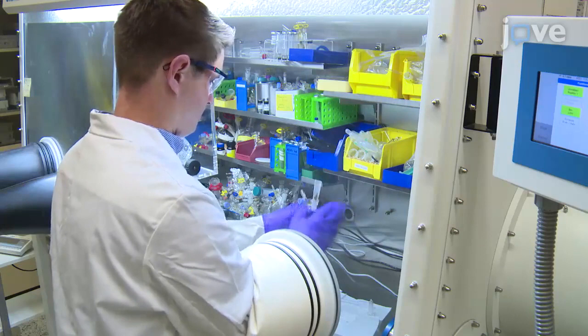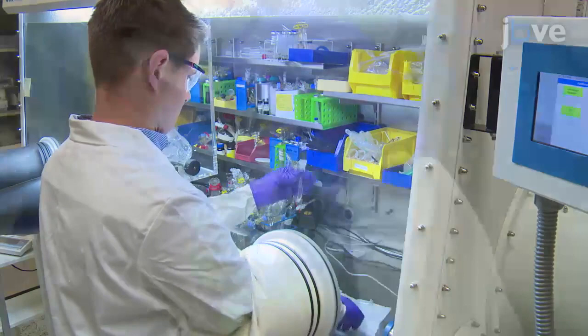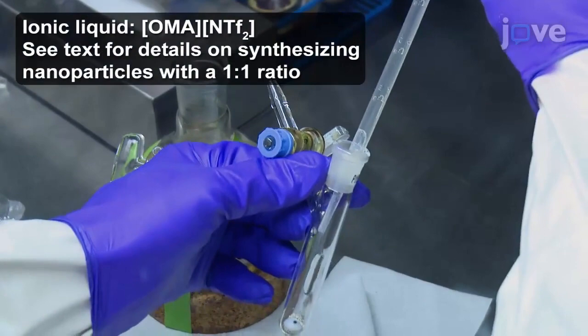To begin, transfer 49.9 mg of platinum-2 chloride and 14.8 mg of tin-2 acetate precursors to a 25 mL Schlenk flask equipped with a stir bar under an argon atmosphere. For synthesis of a platinum-tin sample with a 3 to 1 ratio of platinum to tin, transfer 4 mL of the ionic liquid to the Schlenk flask with the platinum-2 and tin-2 precursors.